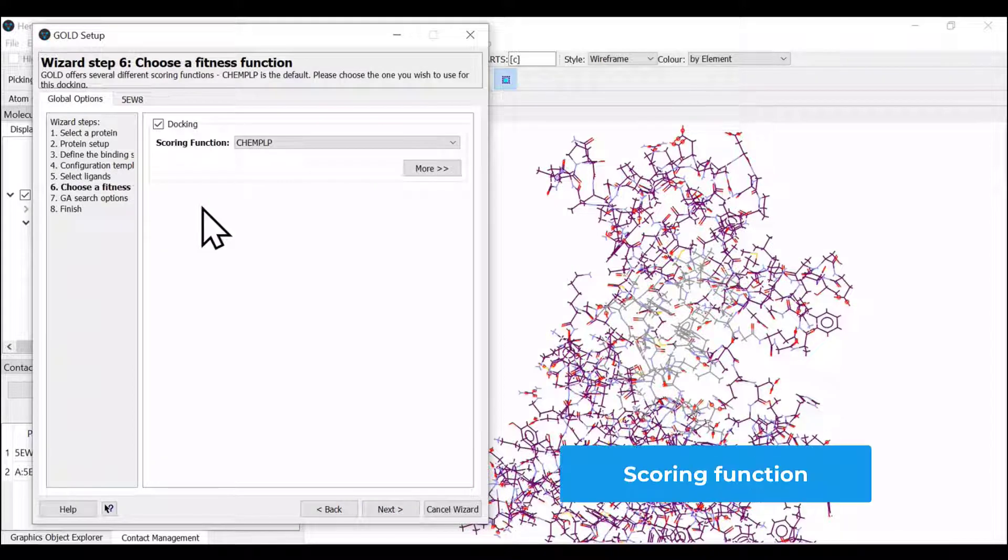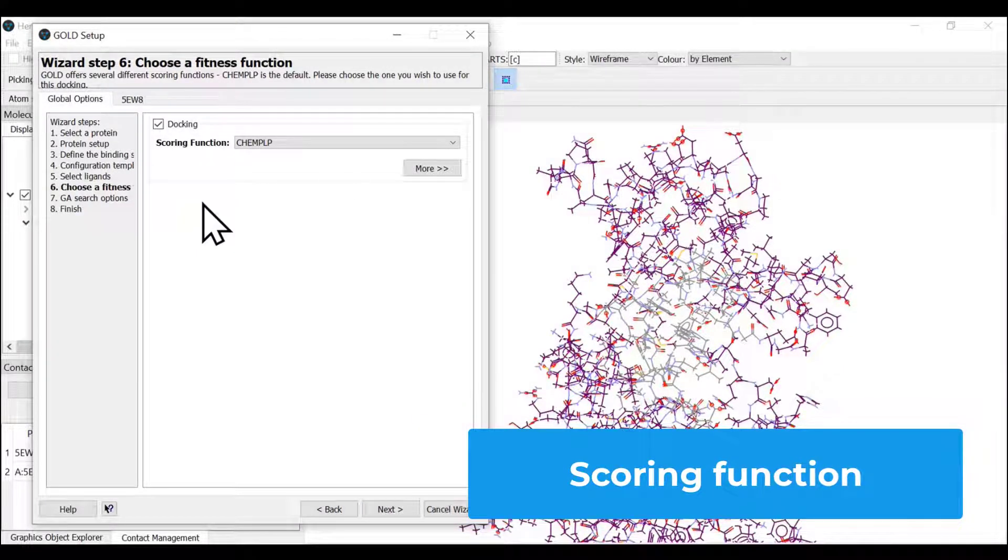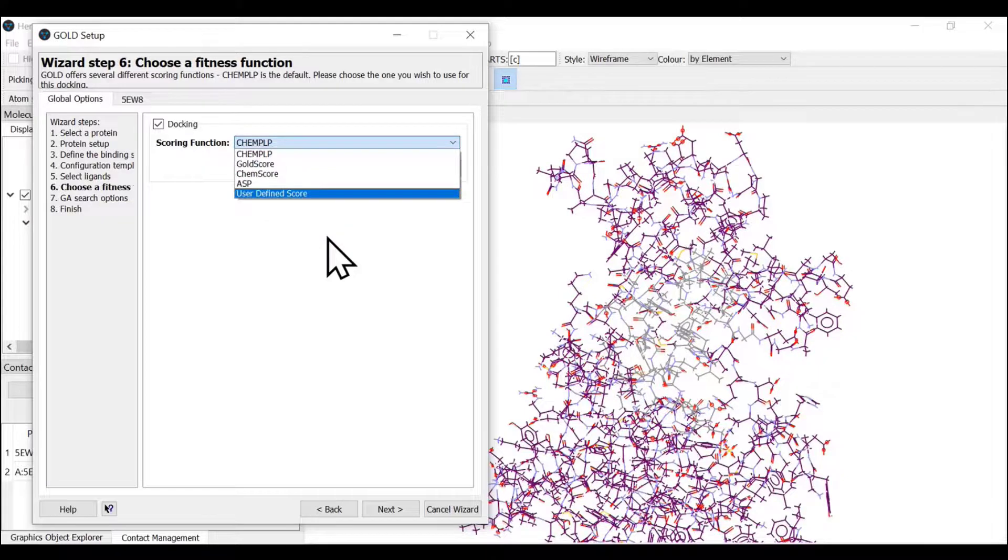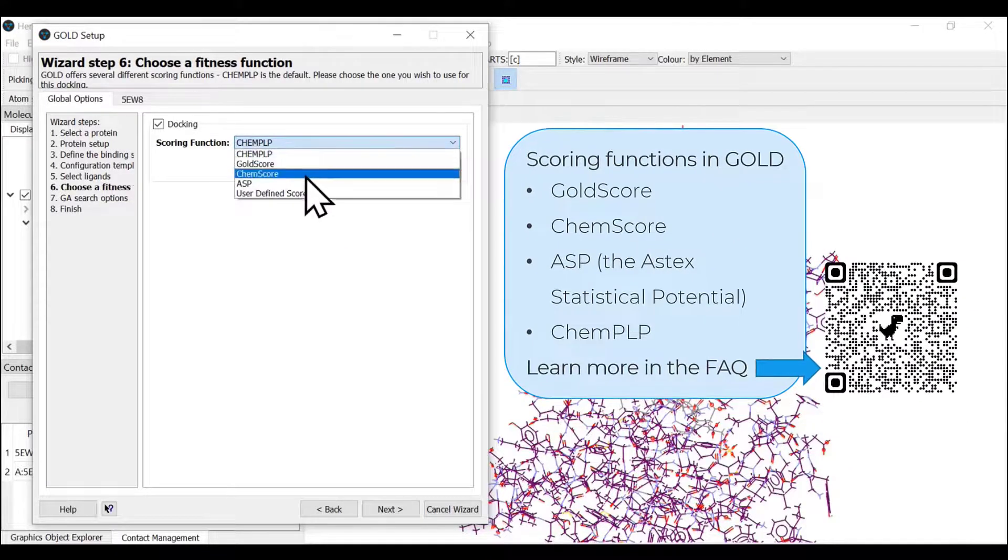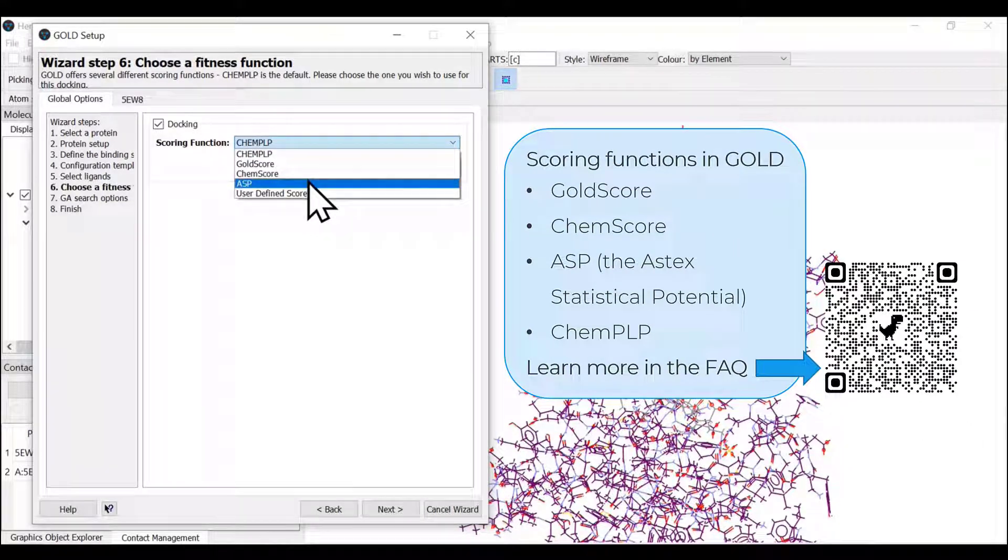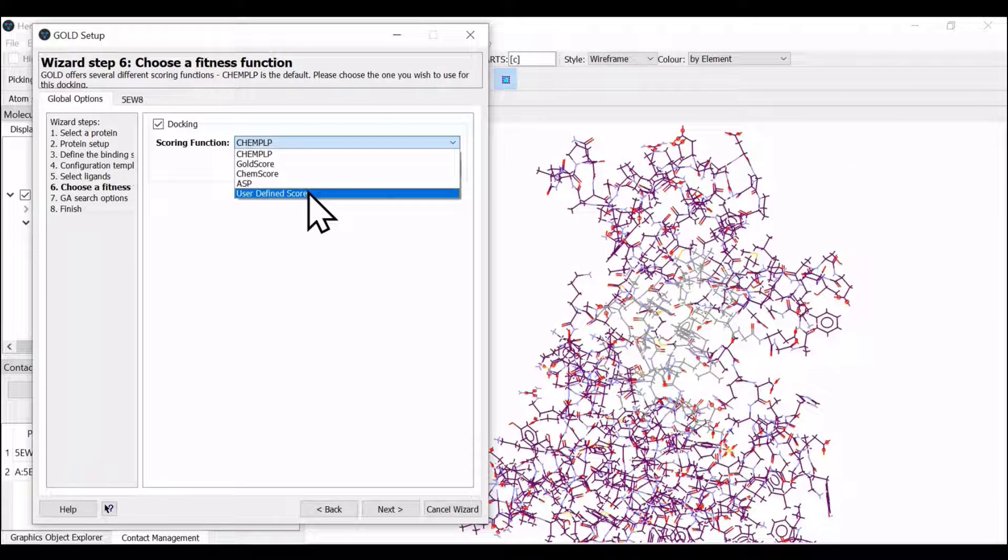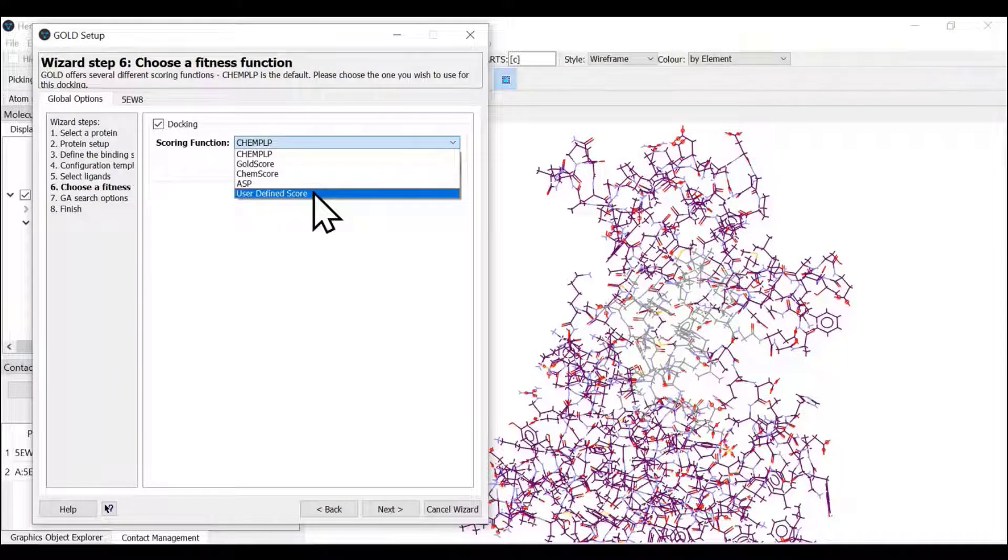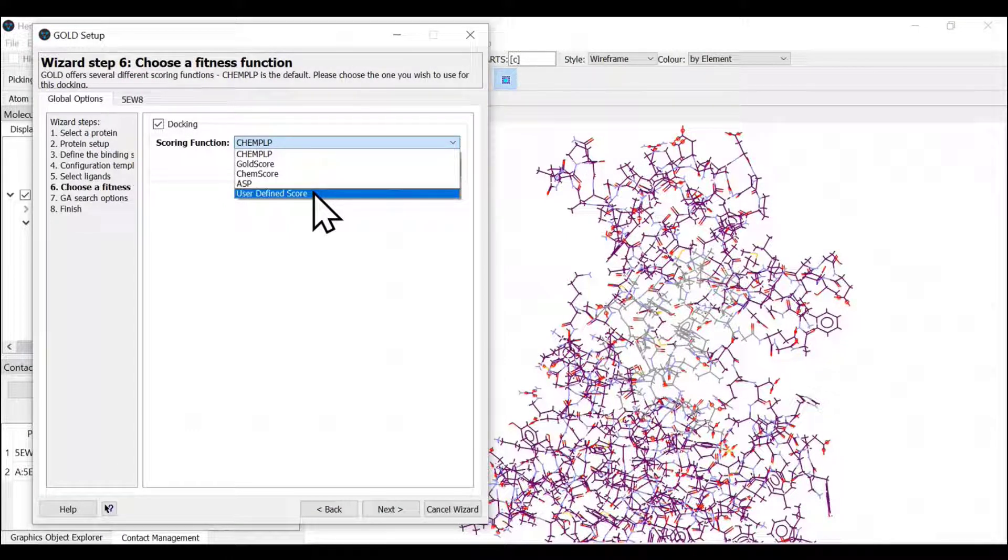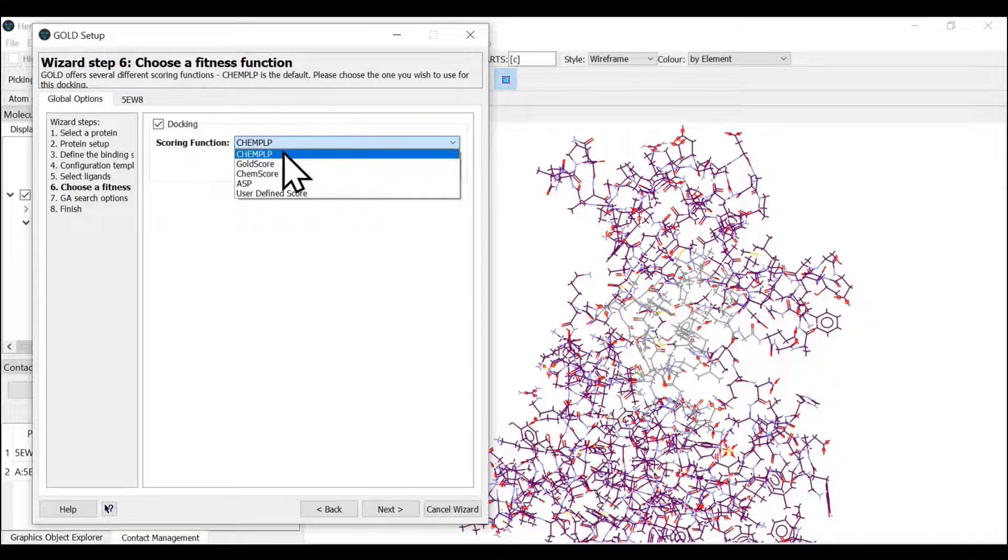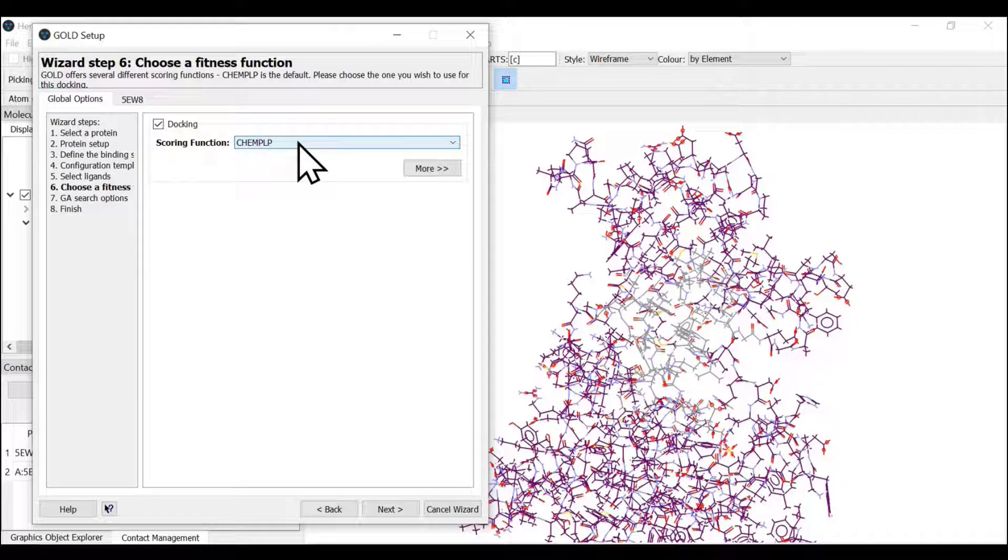A fitness function or scoring function that we wish to use today. As earlier mentioned, we have four scoring functions available with GOLD, but we also have the possibility of defining a user-specific scoring function. The default one is ChemPLP, so we're going to go with ChemPLP.